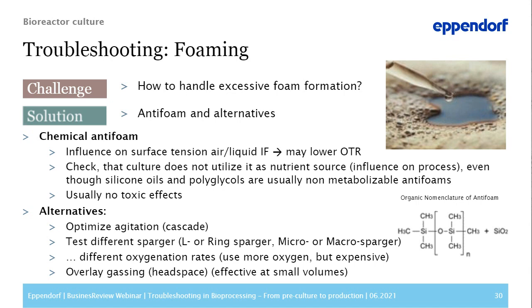Now, foaming can be monitored with the help of level sensors that can distinguish between foam and a liquid. So once foam is detected by the sensor, a pump can start that will add an anti-foam agent. This prevents foam-out events and is especially useful when you're running longer experiments overnight or over the weekend.